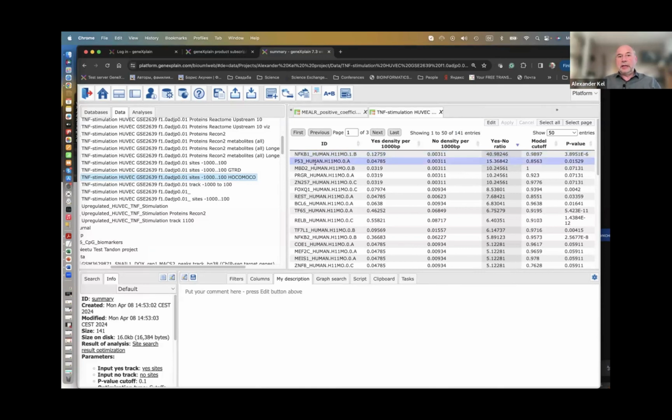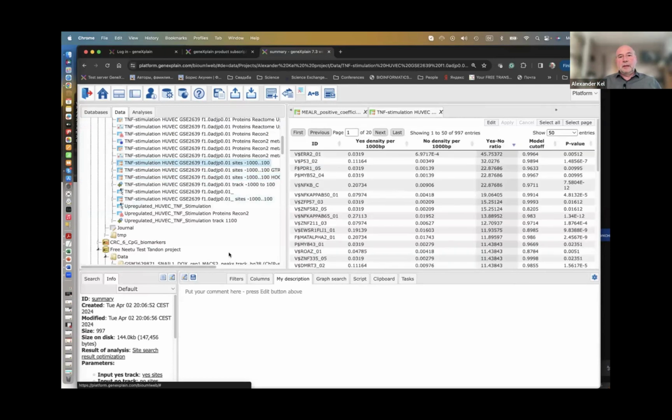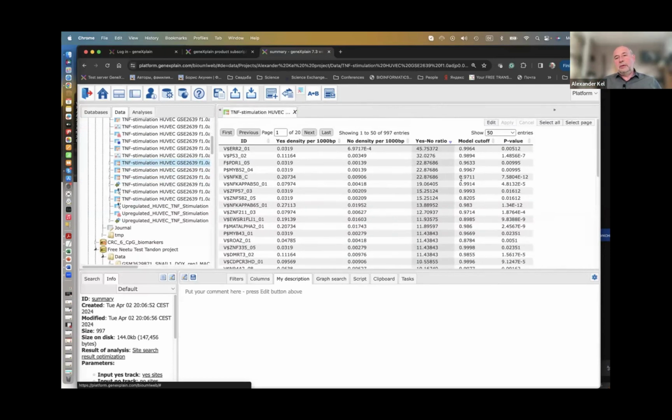But here we're already starting to get some more transcription factors also enriched, which maybe give you a new hypothesis which you cannot get with a smaller collection of matrices. And by the way, if you run the full TRANSFAC, then you get many more matrices to analyze, and many more transcription factors, which can give you an idea what other transcription factors can be involved.